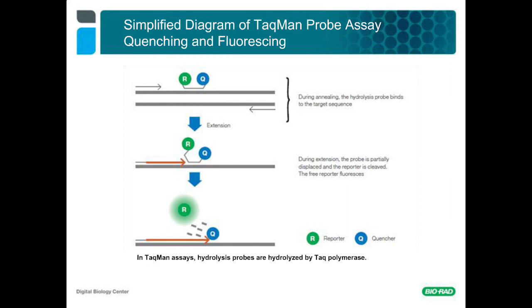Depending on the target and the question you are trying to answer, it may be worth trading efficiency for a longer amplicon. Other trade-offs may be necessary as well, such as having a longer primer and/or modifying the thermal cycling conditions. We will discuss both the amplicon length and thermal cycling conditions in detail.